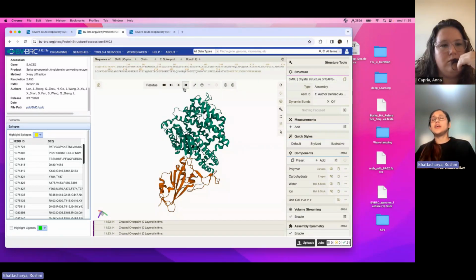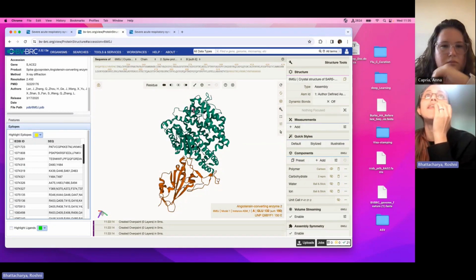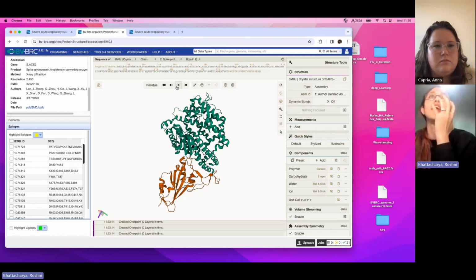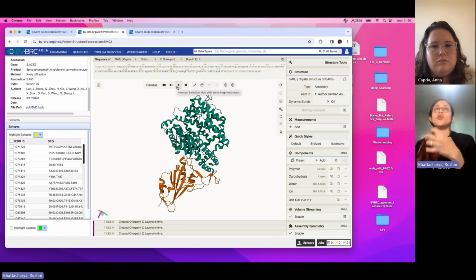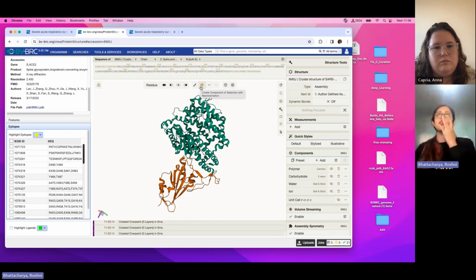Currently, the MolStar has this. You can select one residue and then do this. It will select all others except that residue. It's basically Venn diagrams showing you can select union or intersection between those and something like that. This you can color the selected residue, and this is where you save that component. If you want to save that selection, you can do it.